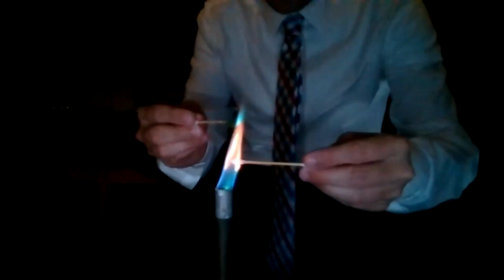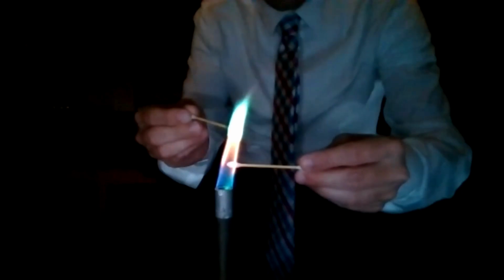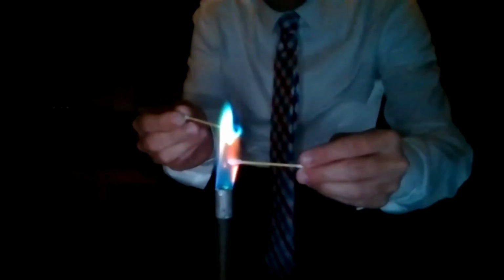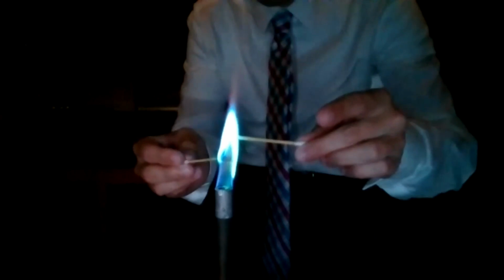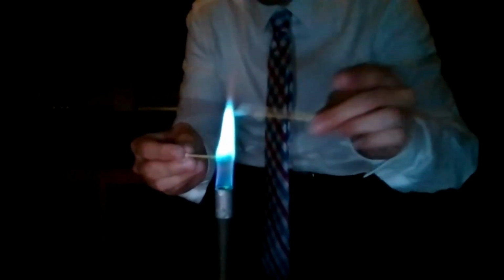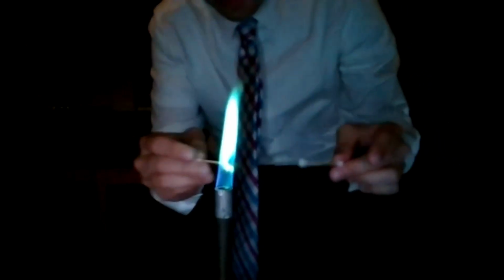That's kind of cool. So it looks like the copper above is still burning green, even though it's burning in strontium's flame. That's kind of cool. I like that. Good idea.